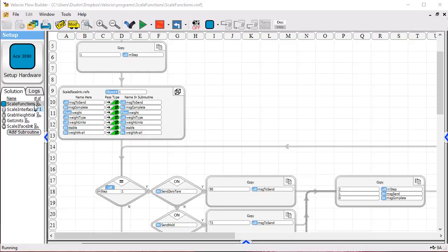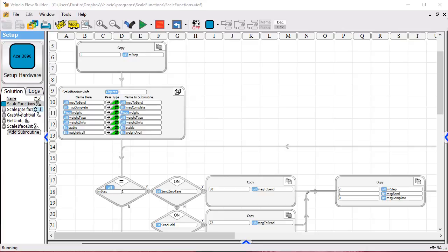That is simply a test program that we've written to exercise the program that does the real work. We've got a program called Scale I-Face or Scale Interface here which interfaces with the scale.